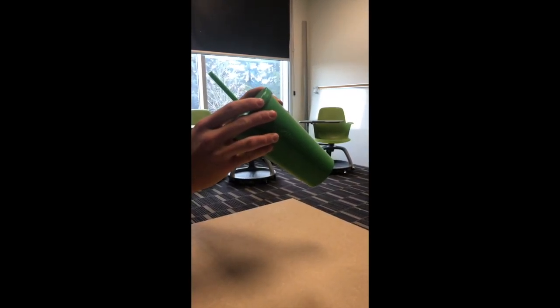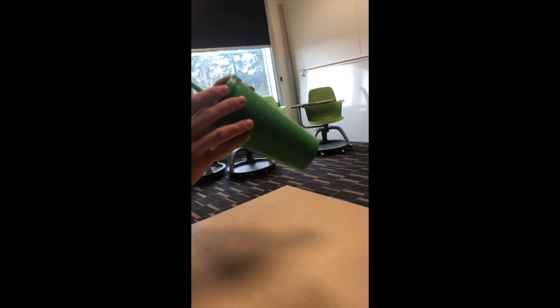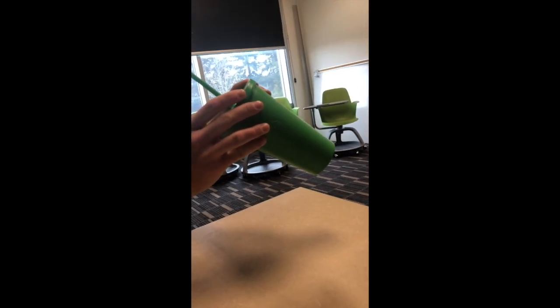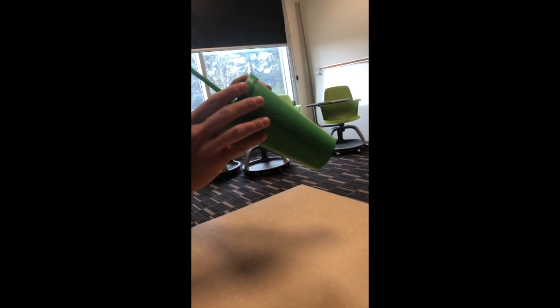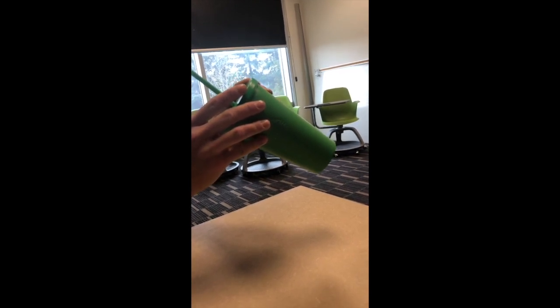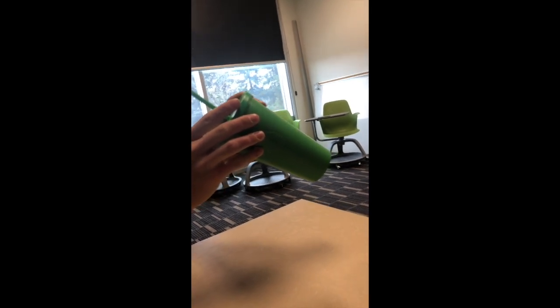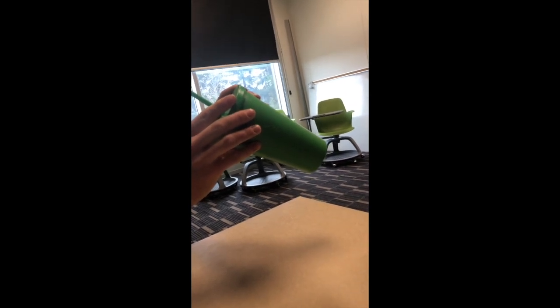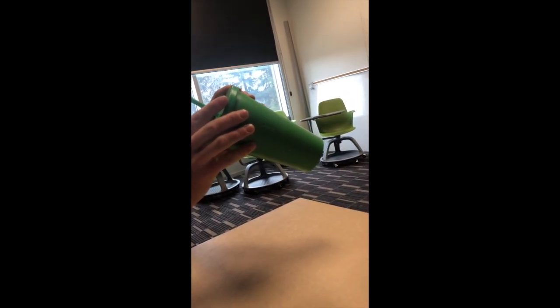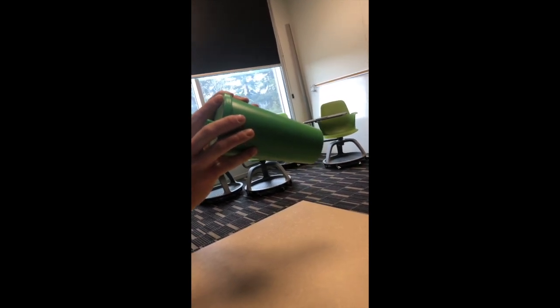Rotary evaporation is a much better way to separate a compound from its solvent than distillation because it is faster for one. It lowers the boiling point of the solvent, and the rotation increases the surface area of evaporation. It is also better than distillation because a lower temperature is used if some part of the mixture is sensitive. In the case of simple distillation, it would negatively affect some compounds if they were sensitive to temperature. And also, the solvent can be reused with rotary evaporation.